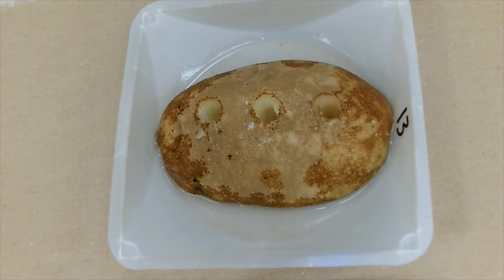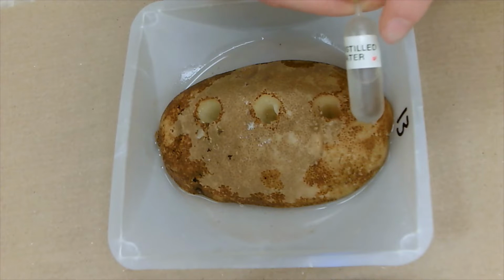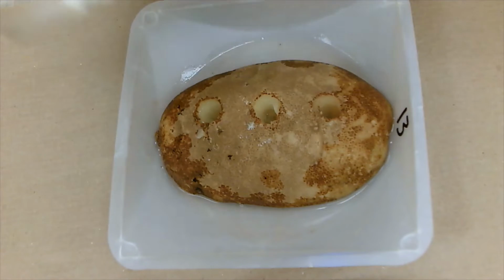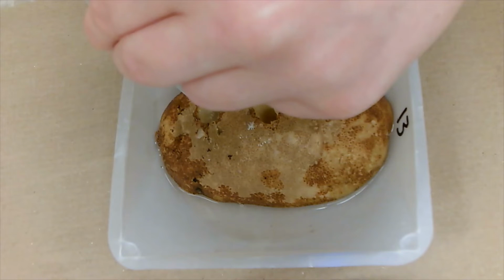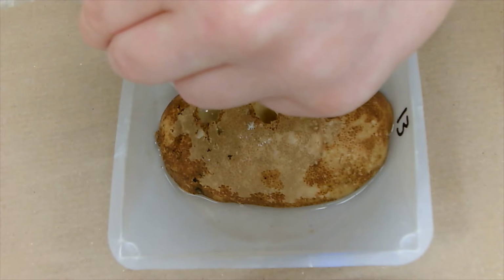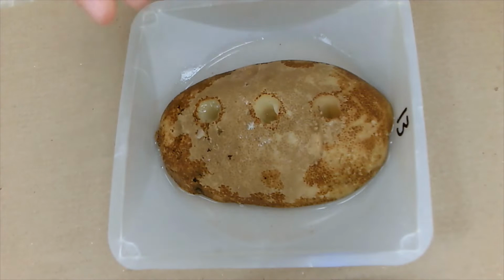Now, what you're going to be doing is in the first hole right here on the extreme right, you are going to be taking your distilled water pipettes and you're going to be filling up the hole with the distilled water. And you want to fill it up so it's not overflowing.